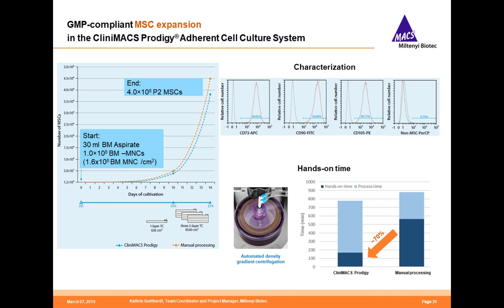So this at the end is quite interesting, because all the hands-on time which is done in the clean room can be really reduced to a minimum.